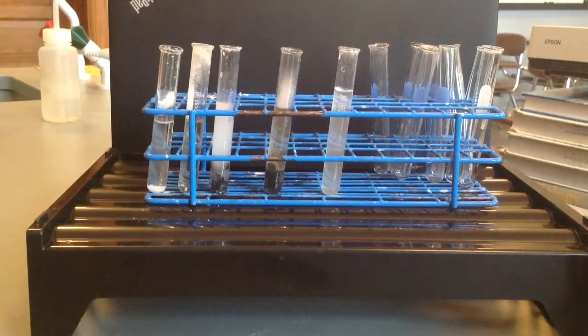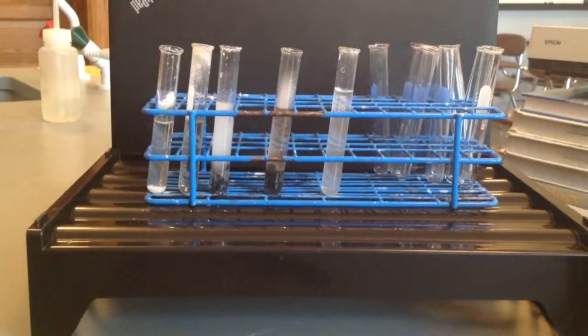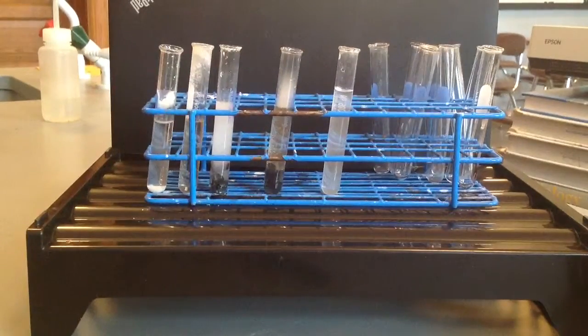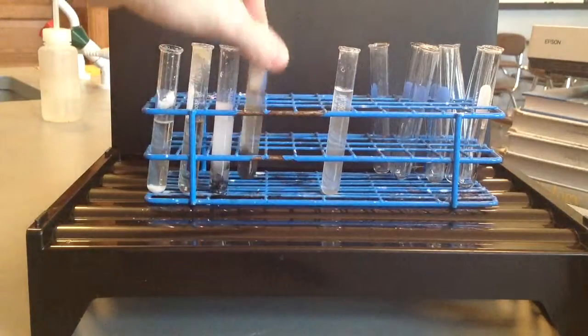So this is moving on to step four. It says fill a test tube halfway with 0.1 molar silver nitrate solution. I filled a little bit more than halfway, but, you know, it's fine. The more the merrier. And so that's our silver nitrate solution in this test tube right here. I'm going to move this one over.